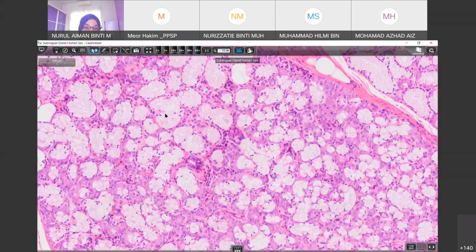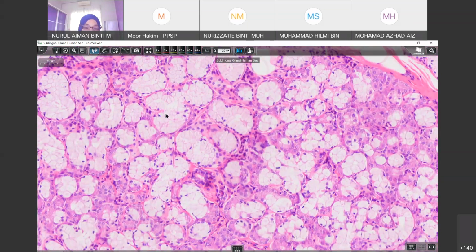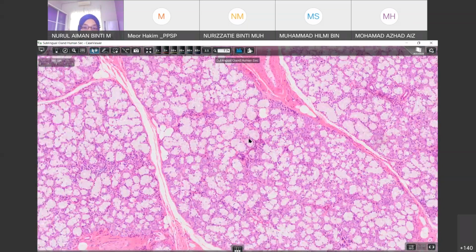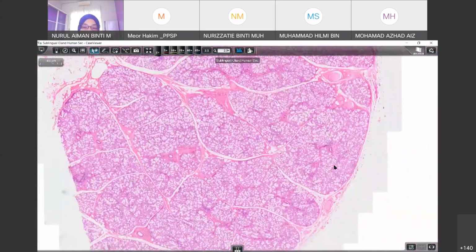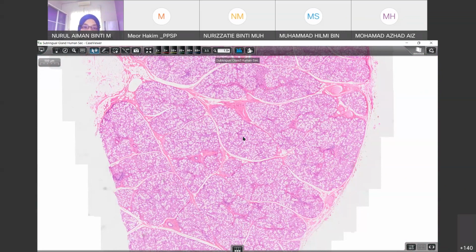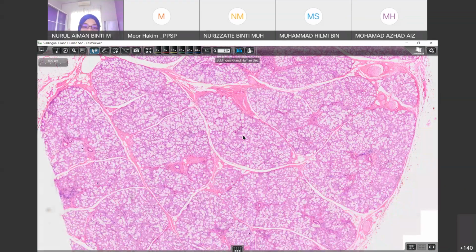Mucus, okay, this is a mucus type of gland. Sorry, again, I go directly towards the gland. In between the glands you have septa, which divide the glands. These are the septae which divide each of the glands. Then you try to focus inside the gland.